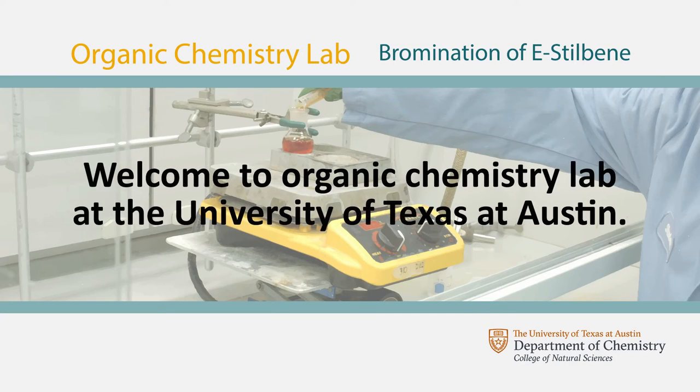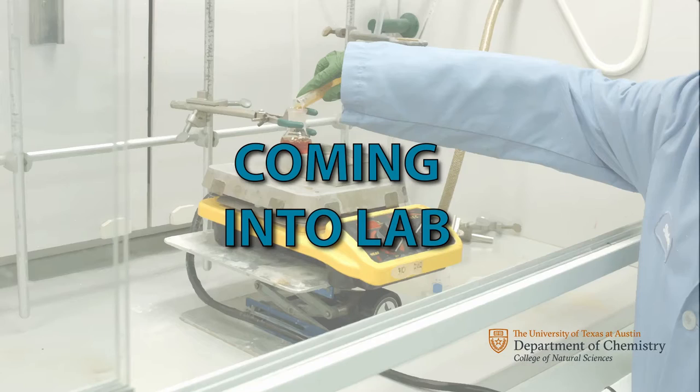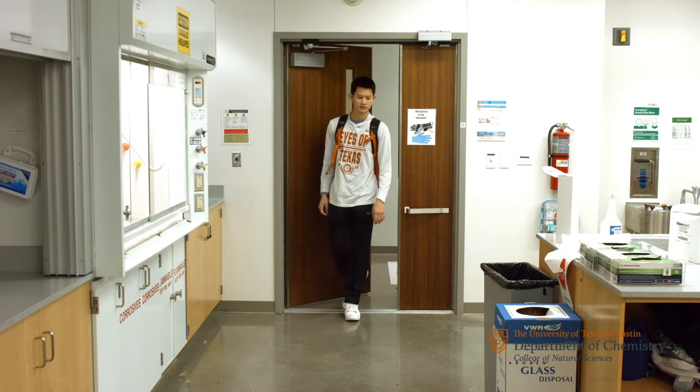Welcome to Organic Chemistry Lab at the University of Texas at Austin. Today we will be going over the bromination of E-stilbene experiment. Please remember to obtain a lab coat and goggles when you enter the lab.